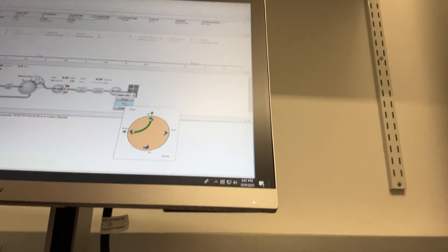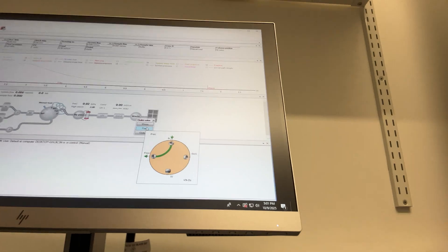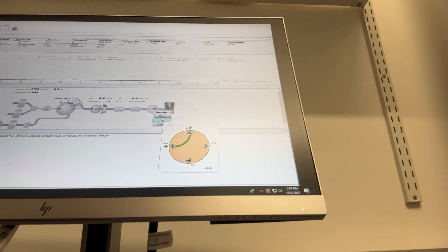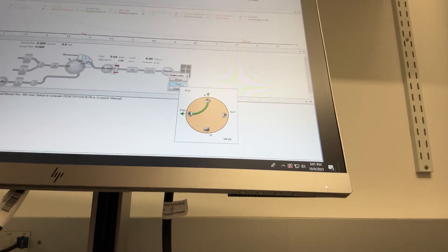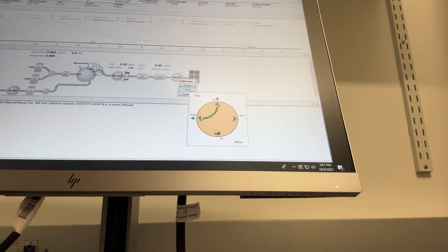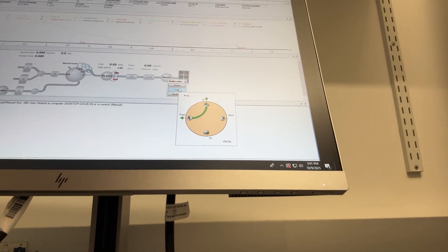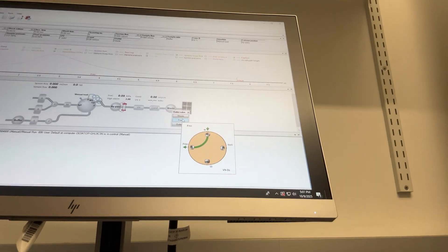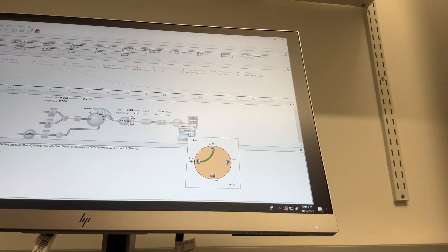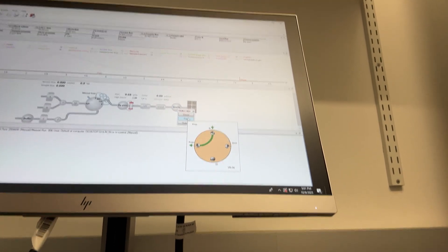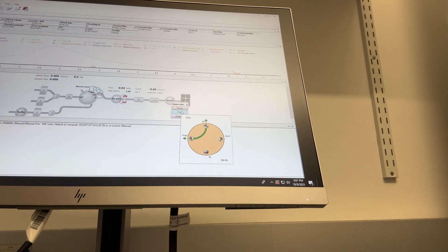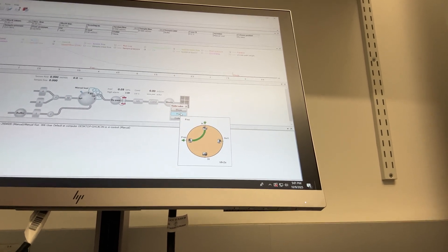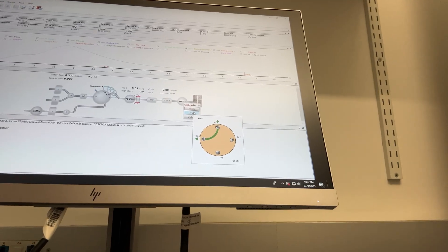But because you have the fraction collector head kind of like going to be in that position where it's just going to go directly into the waste, you're bypassing though, in order to make sure that you're washing that outlet tubing from the fraction collector.